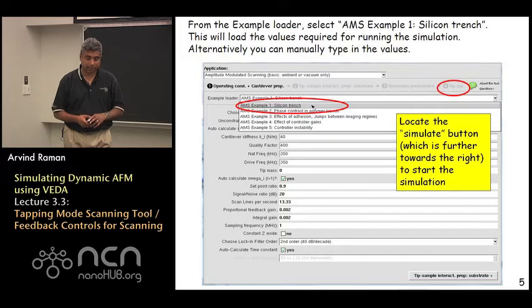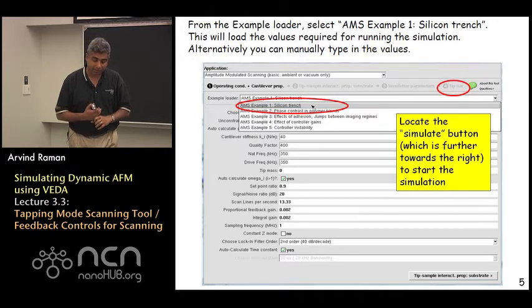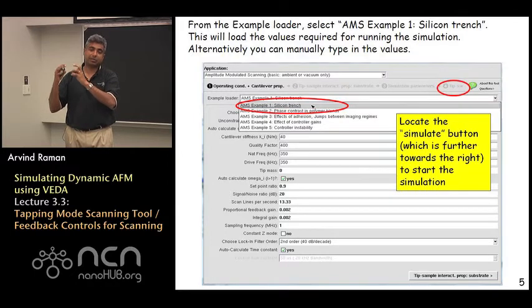So we go to tool choice and select our scanning tool. The important thing to note here is if you scan the top row of options after operating conditions there is actually a feature button.